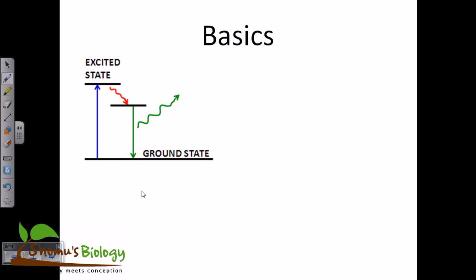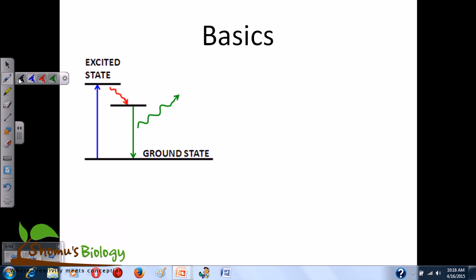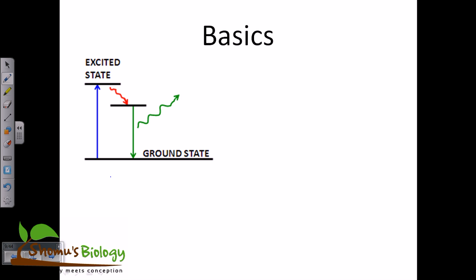To understand this whole process of fluorescence microscopy, you need to understand two fundamental principles. One of these principles is termed the Jablonski diagram. So this is the Jablonski diagram. According to the theory of Sir Jablonski, there are electrons present in different molecules, right? In this case there are different energy states. If you imagine the light coming here as a photon, because in all types of fluorescence microscopy we look at light as a photon, this photon has different energy levels.